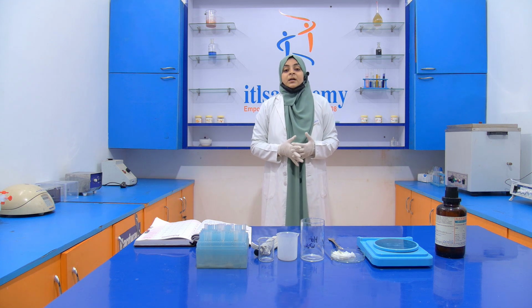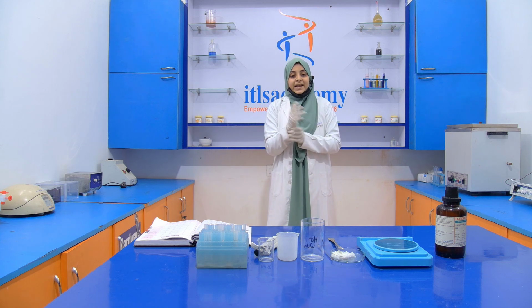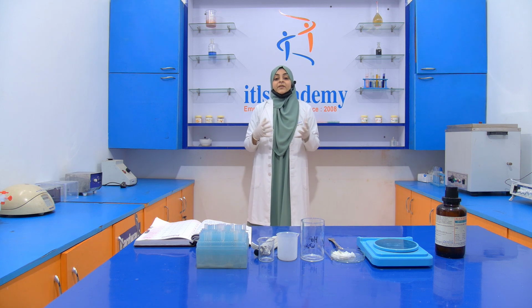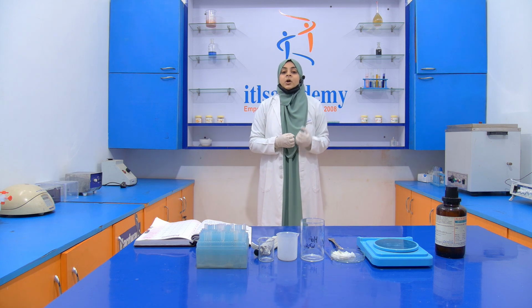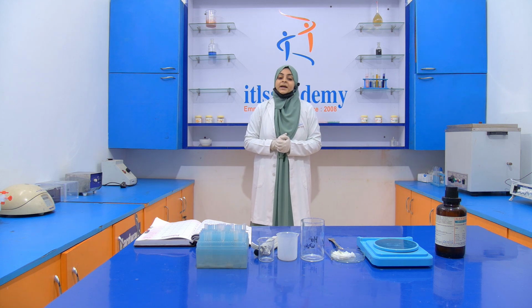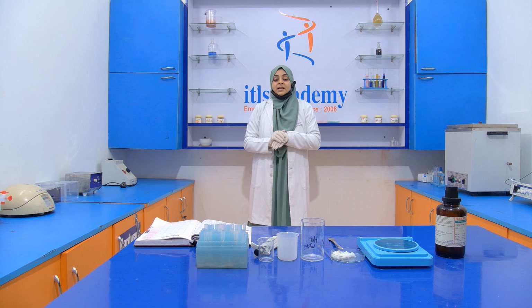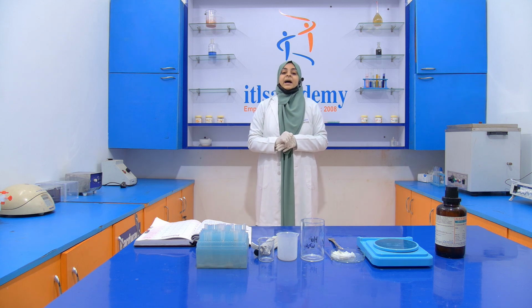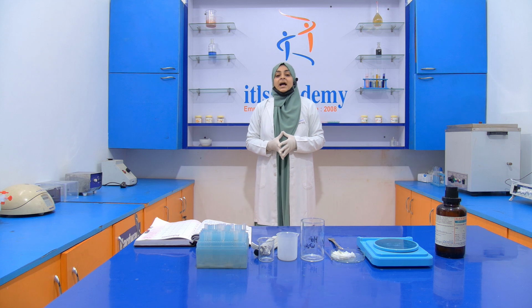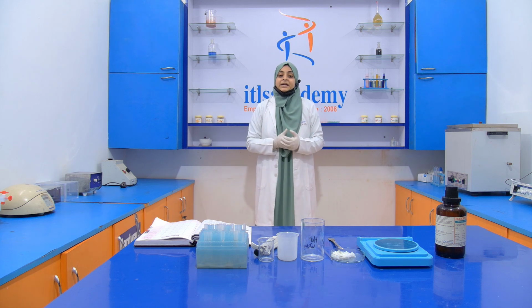When we are performing this experiment, we have to wear proper gloves like this, a proper mask and a proper lab coat, and we have to avoid direct contact with this hydrochloric acid. Otherwise, if it is absorbed by our skin, it will damage our skin and cause skin irritation, and it will also damage our eyes and cause eye irritation.